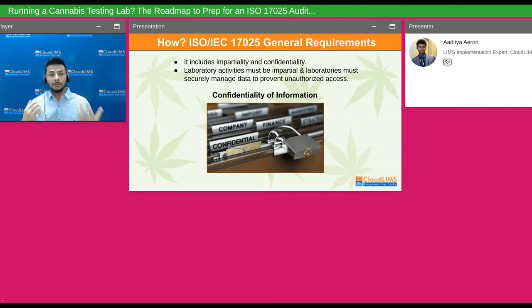What you can see on my screen is confidentiality of information being discussed. You've got a large number of people on your team, let's say, and you're working with partners, and with other people who might want to access the same batch of samples and check for various other pieces of information. So you want to make sure that your confidentiality is maintained at all times.